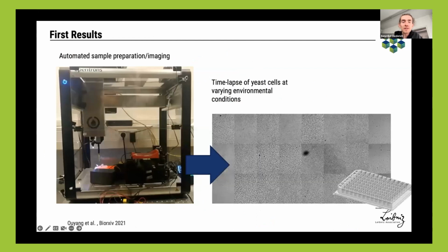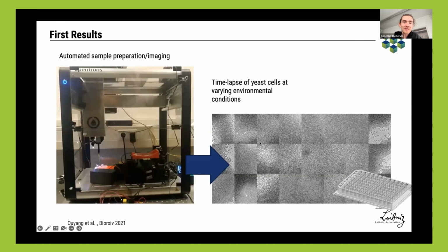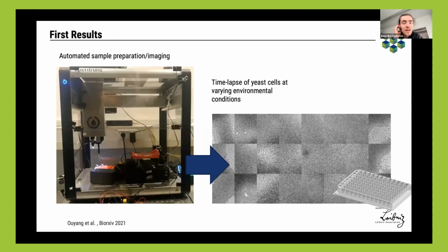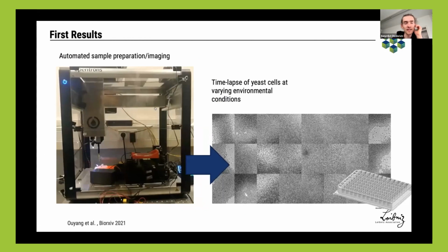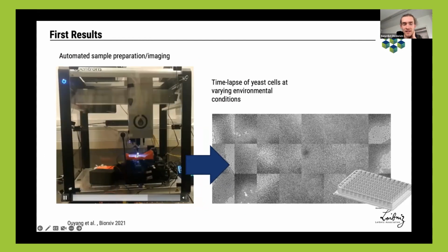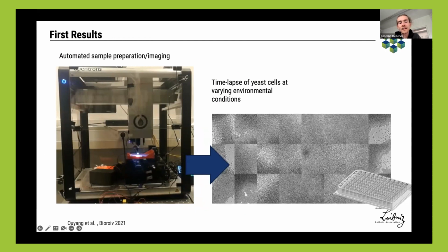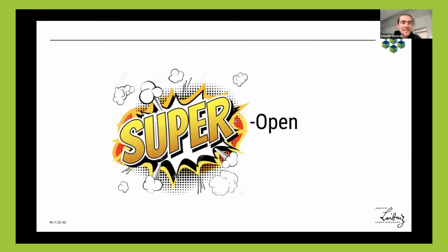And so what we did, since I have roughly no idea about biology, we just used some yeast cells and added different solutions of sugar and peptone in order to increase the growth rate. And so the little microscope, what you see here, is then doing automatic imaging, and then finally also analyzes the highest growth rate there. Yeah, and so finally, I think Johannes nicely phrased it already, so I don't need to talk about that too much.